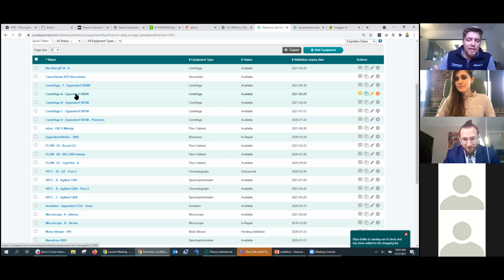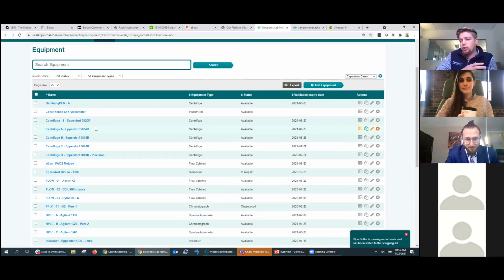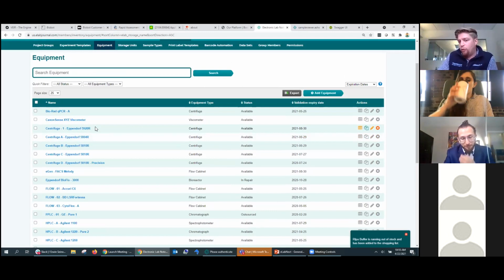And I'm watching this presentation right now and I'm thinking, obviously, this extent of digitalizing the lab probably wasn't there 10 years ago, but something like this for a startup to start these behaviors will pay off huge down the line when you need to make the decision of either replacing a piece of equipment or a big investment, like changing out a board or something that might be very costly. You can really make an educated decision looking at the history of the equipment and all the PMs that you've purchased or replacement parts that you've purchased in the past.